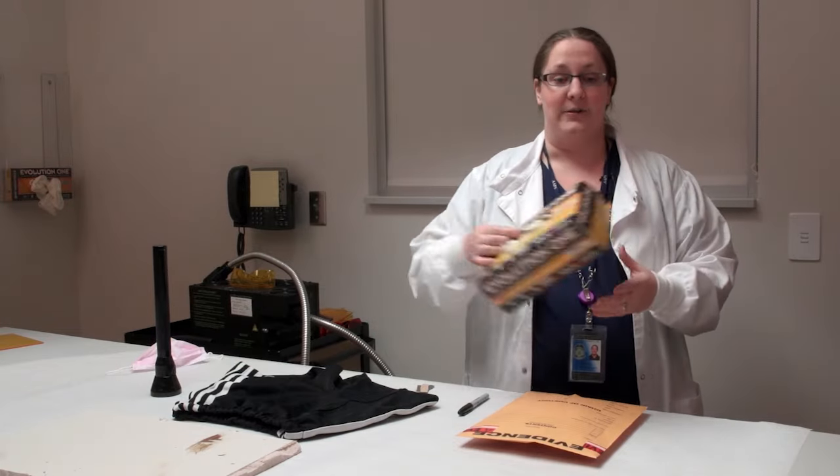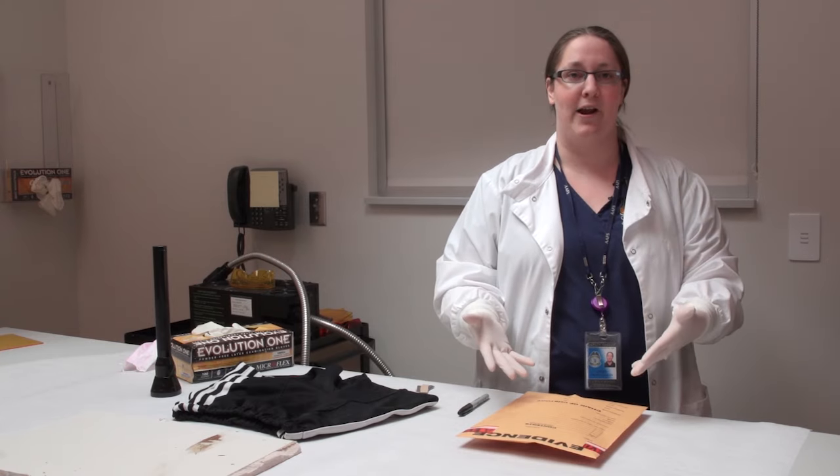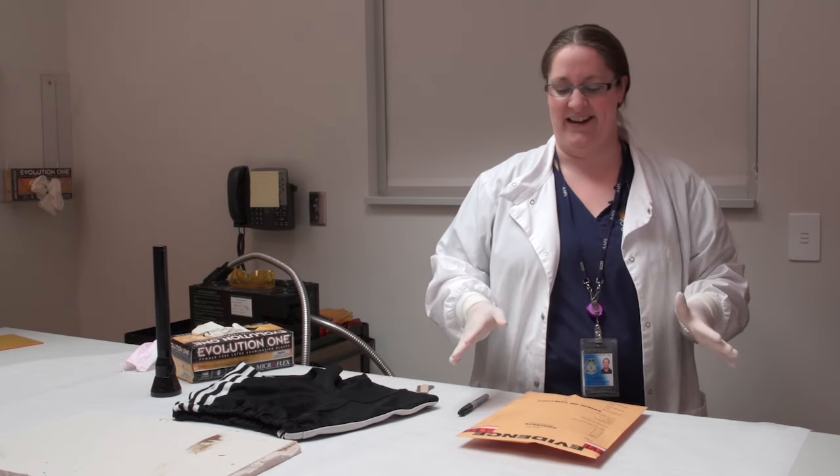In the DNA section, we want to be really cognizant of the fact that we all have DNA and we can put that DNA onto evidence if we're not careful. So we always want to wear gloves, and we change them very often so we're not getting our own DNA on the evidence, which would be very bad for a case.